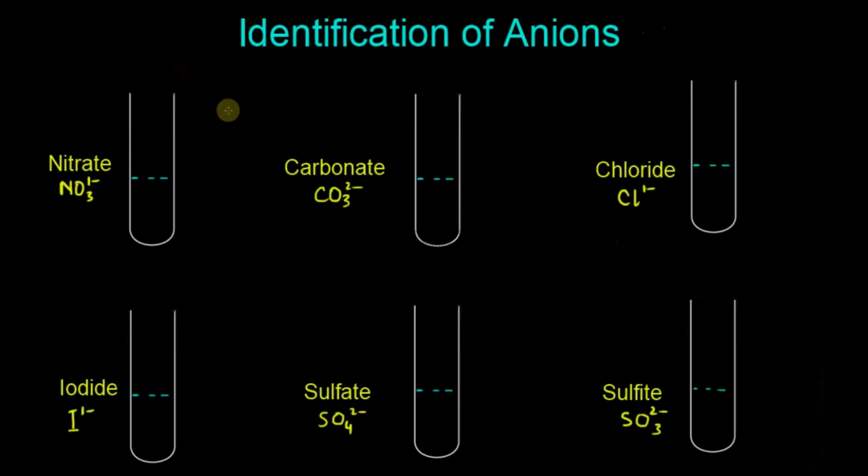Hello everyone. In this video we are going to see the identification of anions. Anions are negatively charged ions. So let's see first of all the identification of nitrate ions.